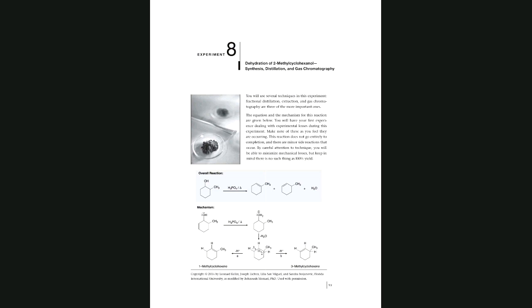What are the next steps so I could get ready for the chemicals and next step? Okay, when I'm sharing the screen, can you see the setup in the large window, or should I take it out so you could see the video of the setup in the large main window?